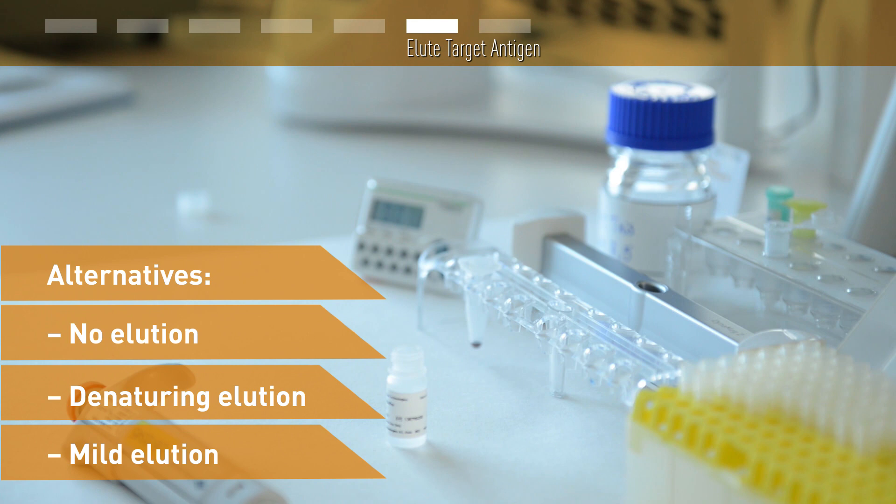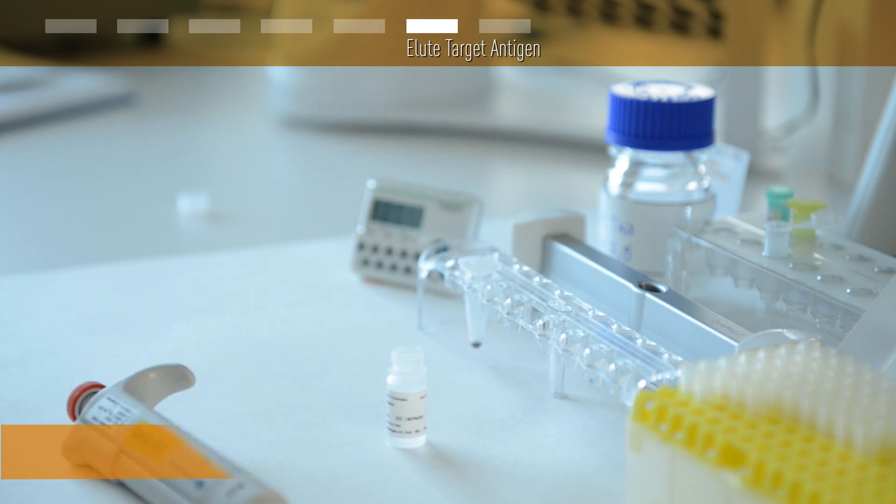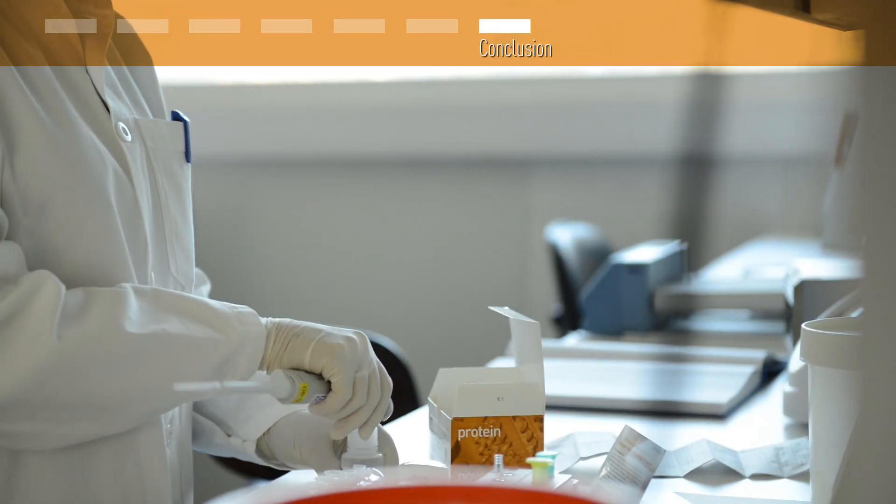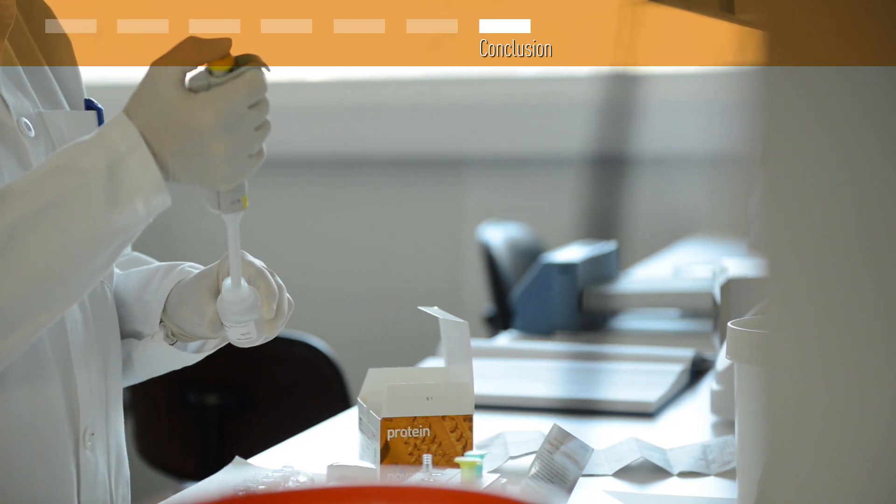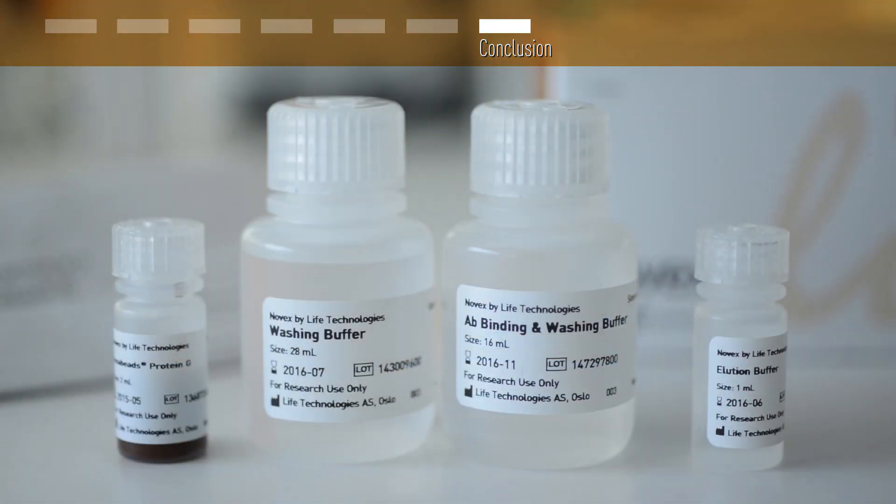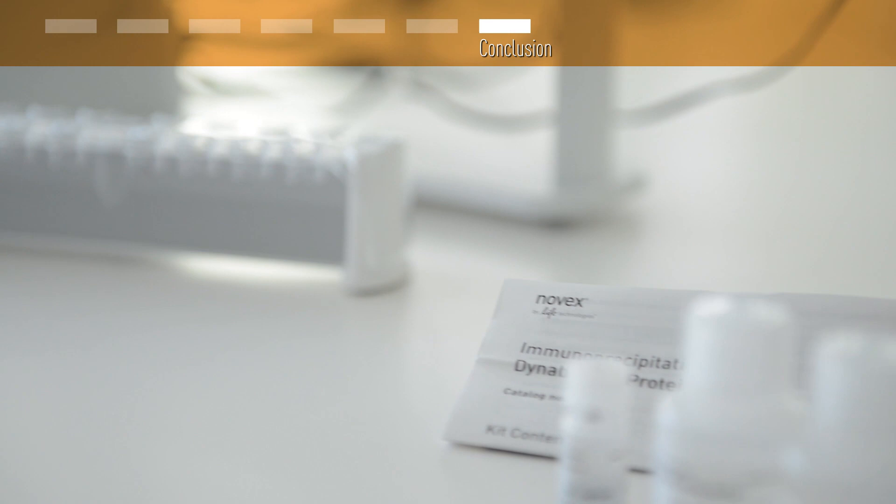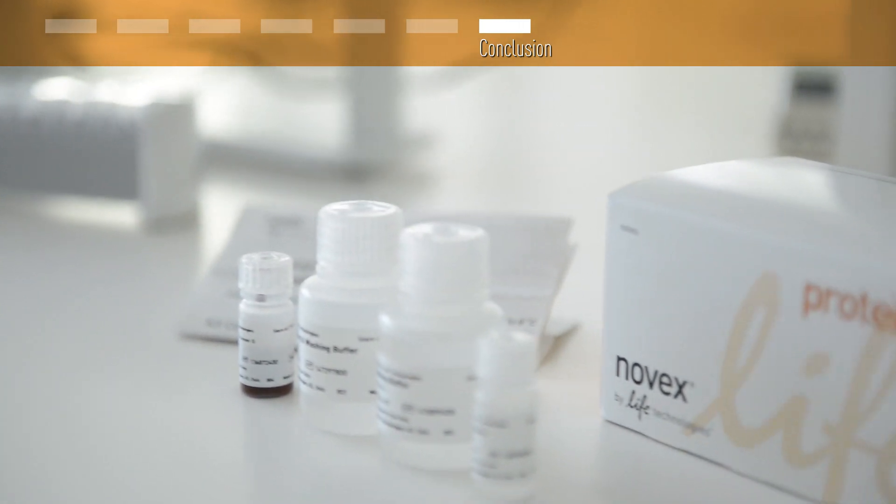The DynaBeads protein A or protein G are available both as a stand-alone reagent or as part of ready-to-use kits with buffers included. The beads are used for standard immunoprecipitation and to pull down larger complexes in co-immunoprecipitation.